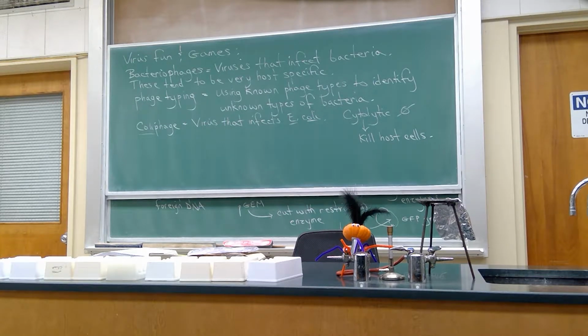Don't get too excited about the label on these plates. These plates are labeled simulated sewage. Just to let you know, it's not simulated sewage.